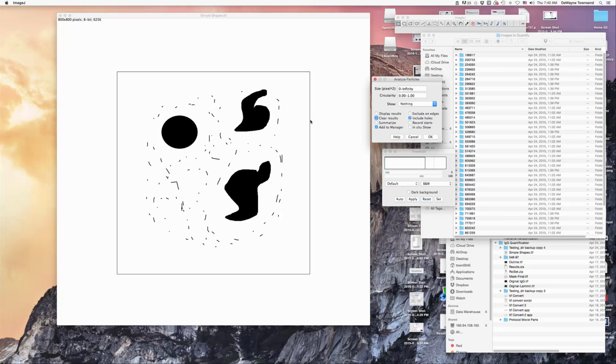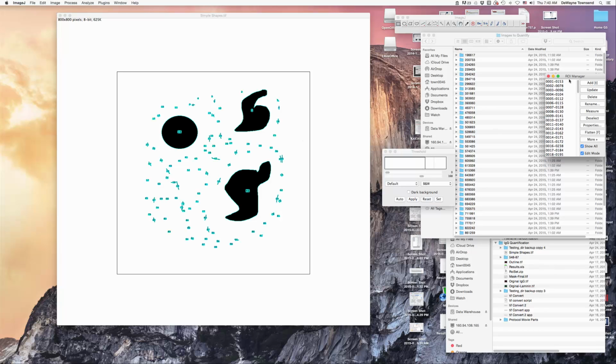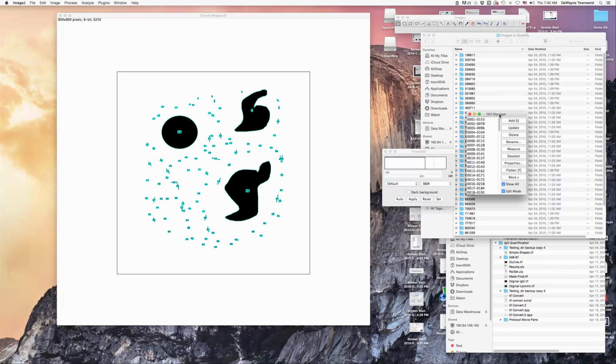Okay, so now we're going to input our thresholded image into this algorithm, and let's see what happens. Here's that ROI Manager I was talking about, and you can see it produced a very long list of all sorts of little spots. Number 1 here was one of our lesions, number 16 is another one, and number 46 is a third. But we got all these other little spots. Now that's going to be a problem, because we want to understand how many lesions there are, and these aren't lesions, these are just noise in the background. So how can we deal with that?